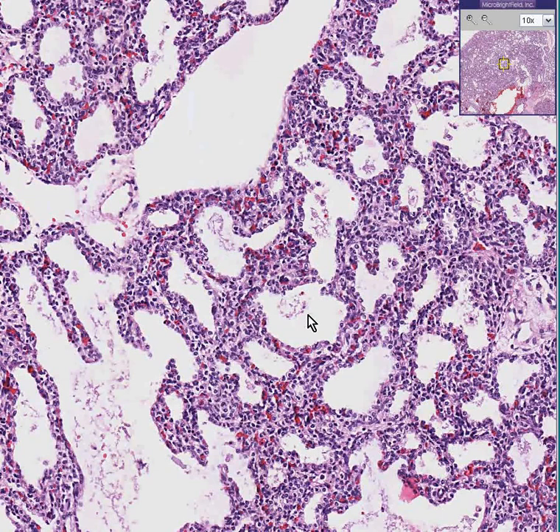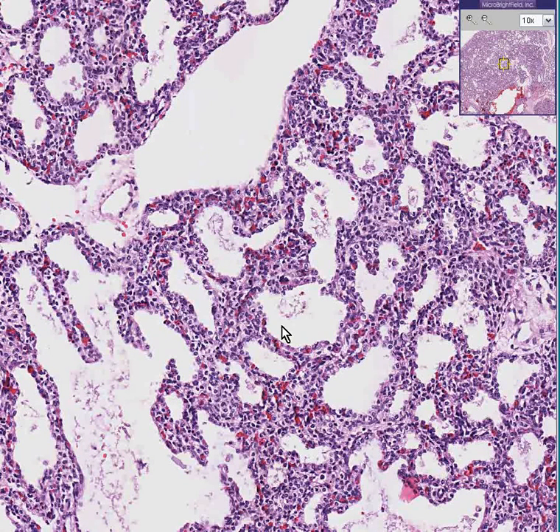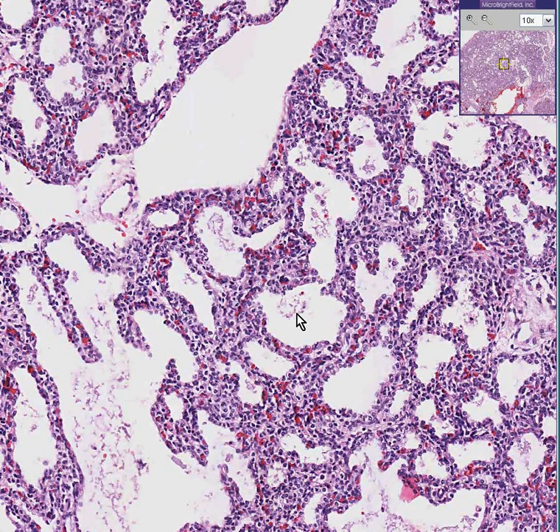If you want to take one thing home to the bank: if the cells infiltrating the lung are in the alveoli, think bacteria. If the cells infiltrating are in the septae, think viruses.